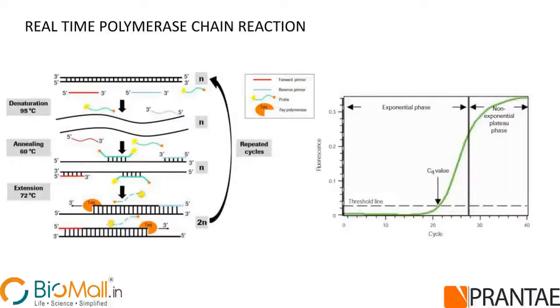But how do you do that? Because the amount of virus is going to be extremely low. And secondly, it's RNA. Humans also contain RNA. So how should we be able to do this bifurcation of presence or absence? Now, this is done by a modified version of the polymerase chain reaction. And polymerase chain reaction does something very simple.